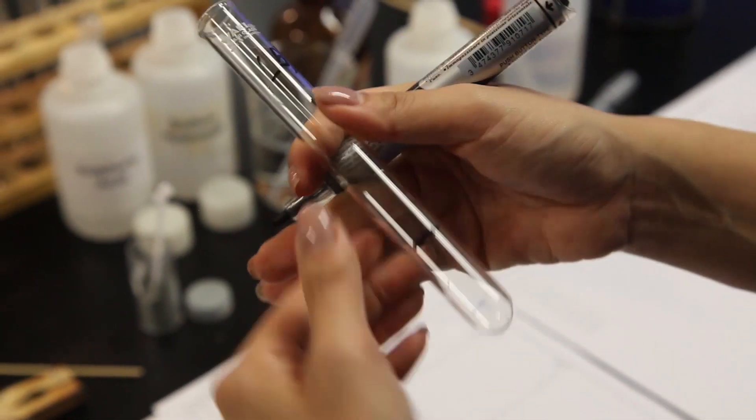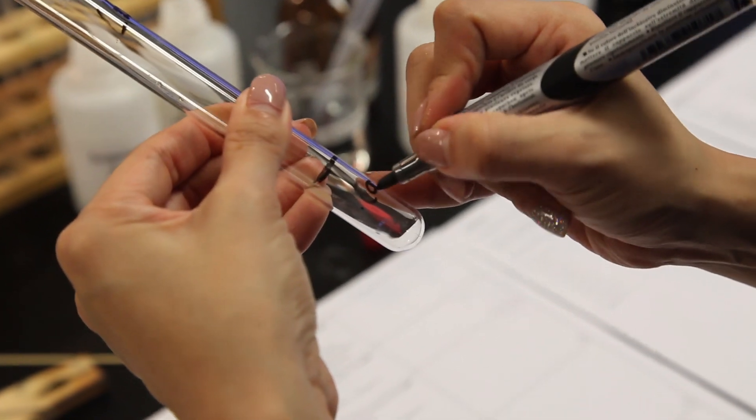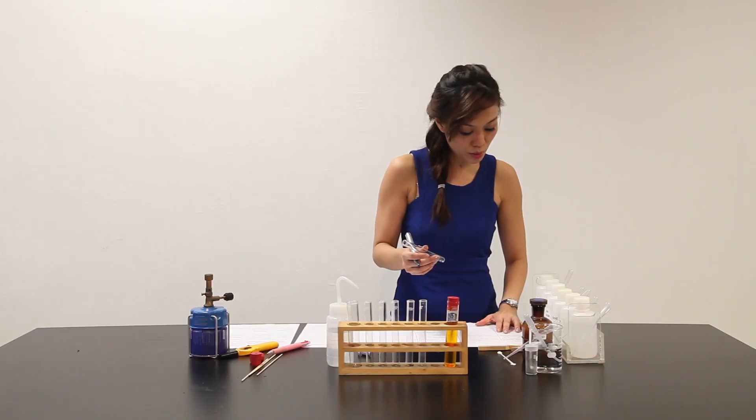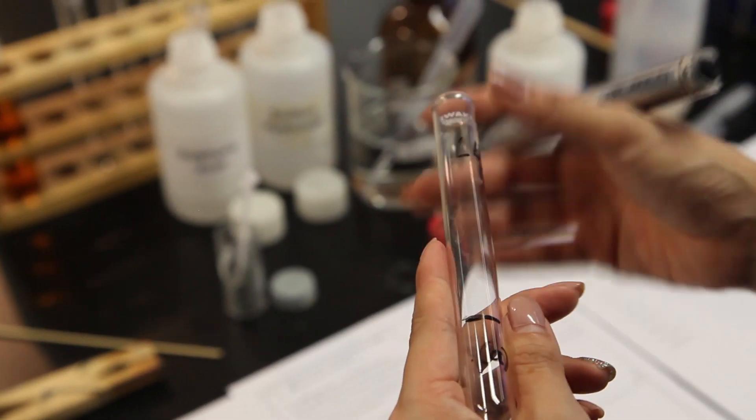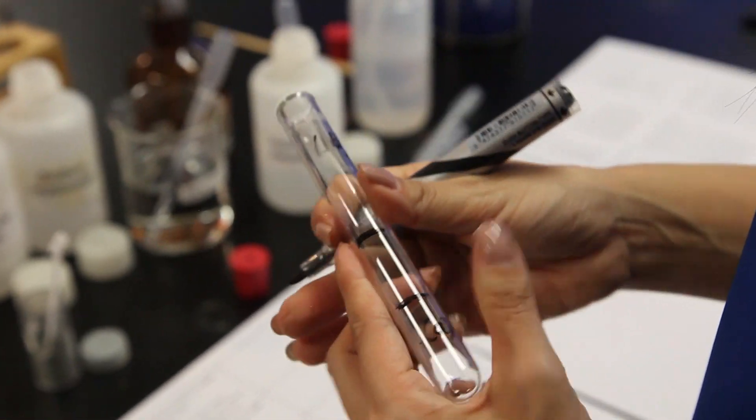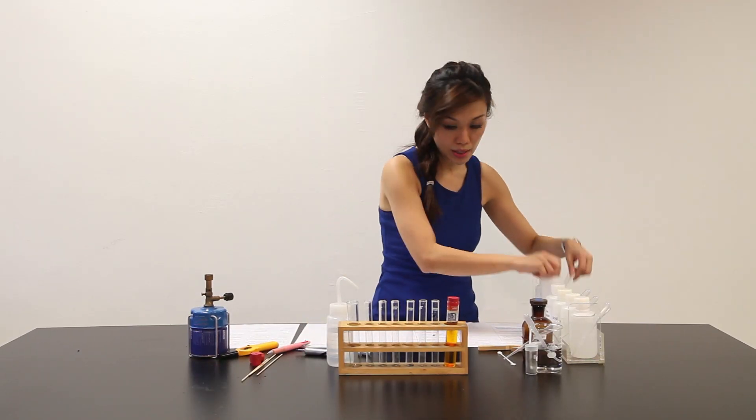4 cm³ of part A in a clean test tube. To this test tube, add about 4 cm³ of sulfuric acid and another 4 cm³. And let me take out my H2SO4 from here.